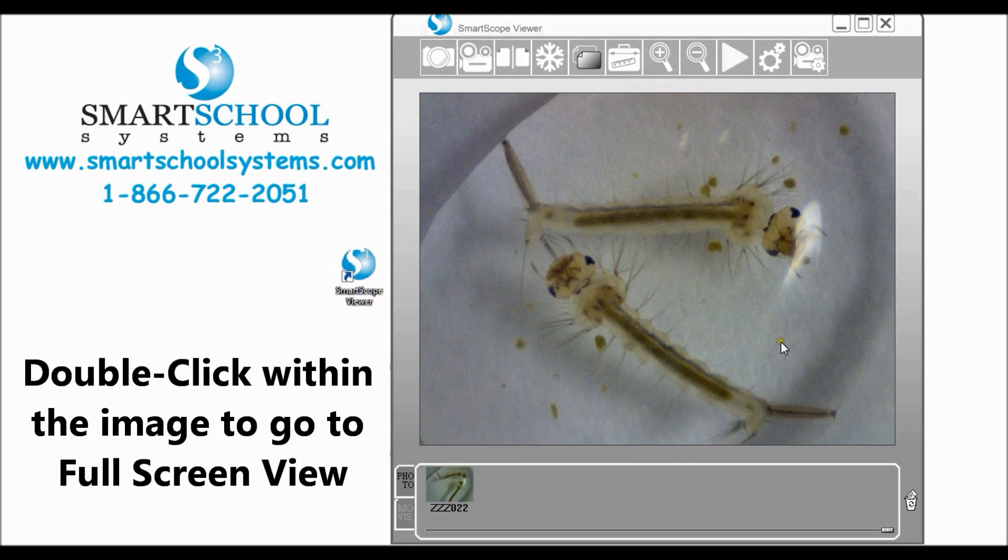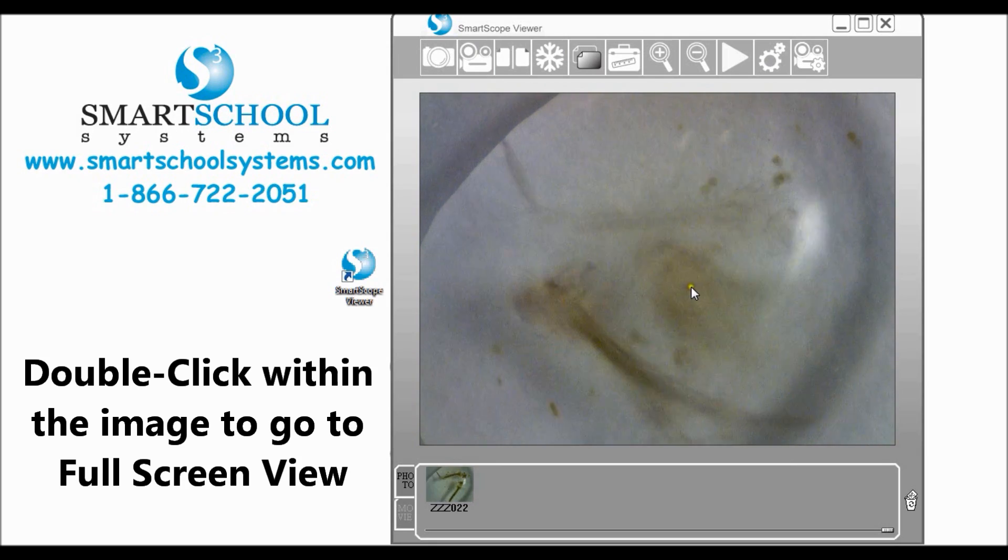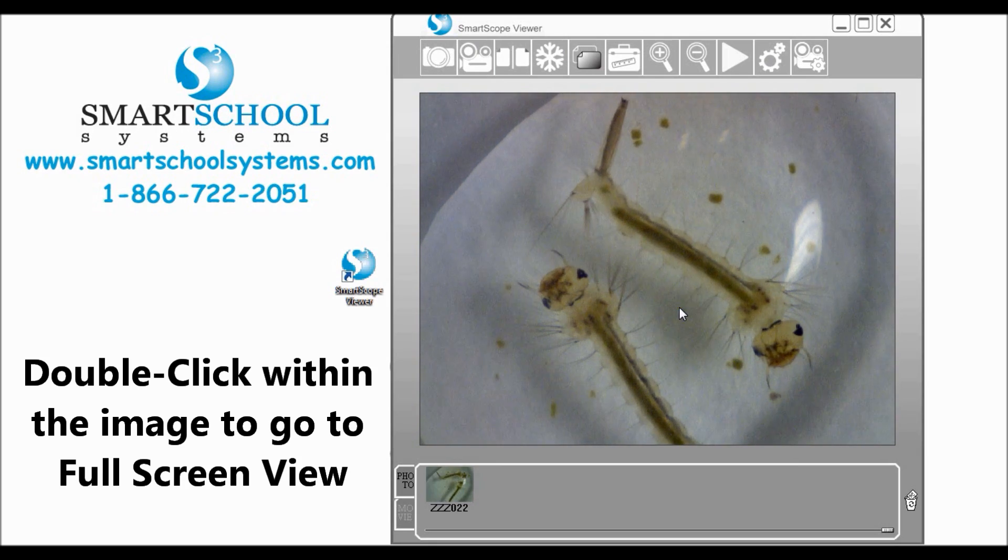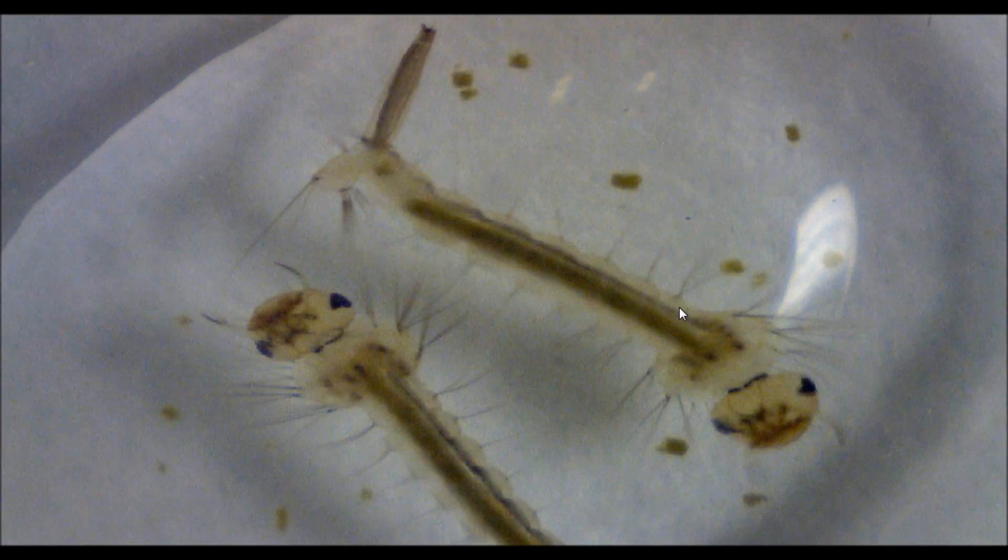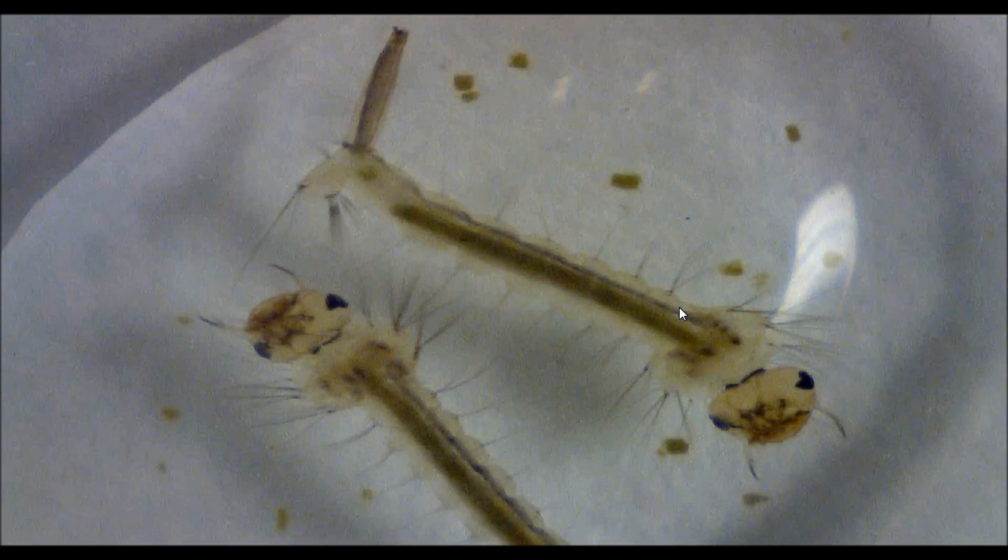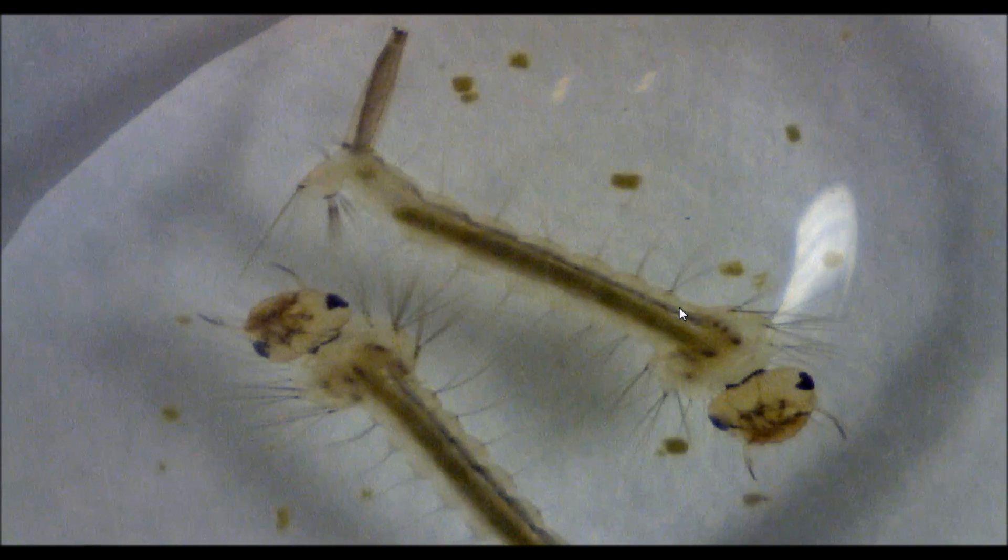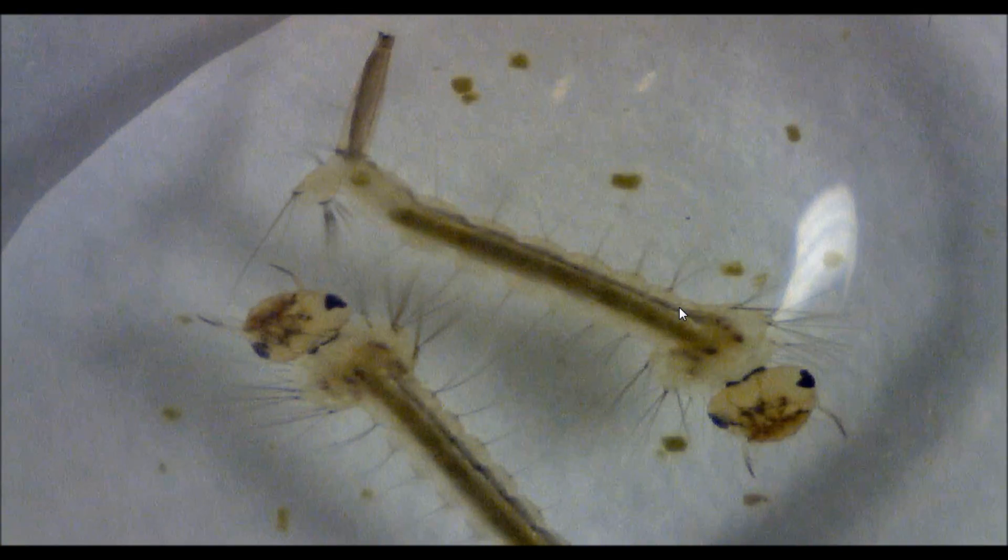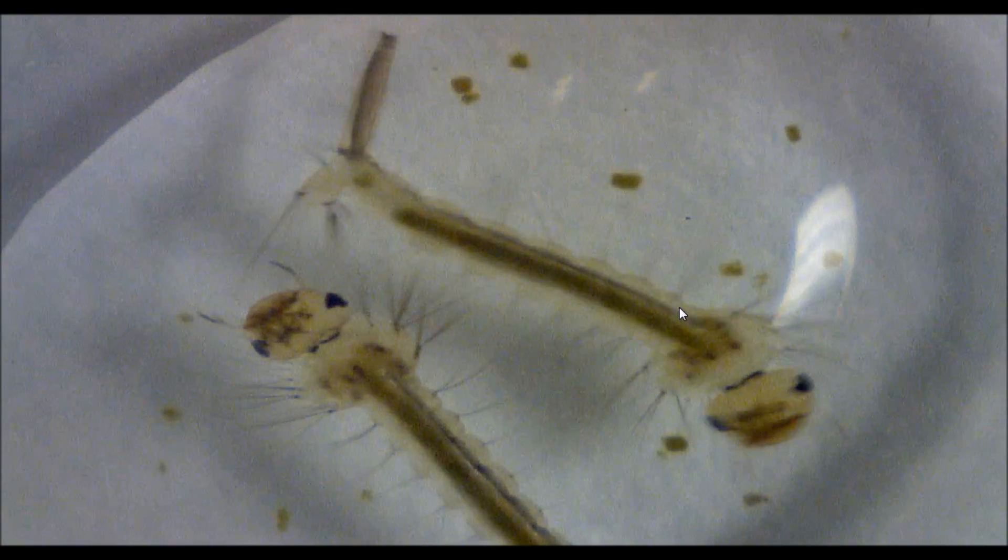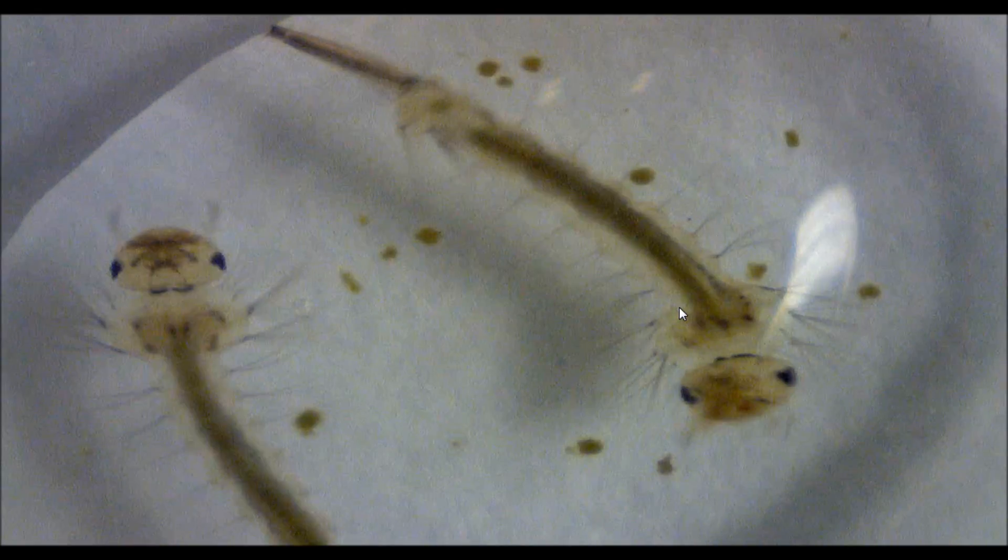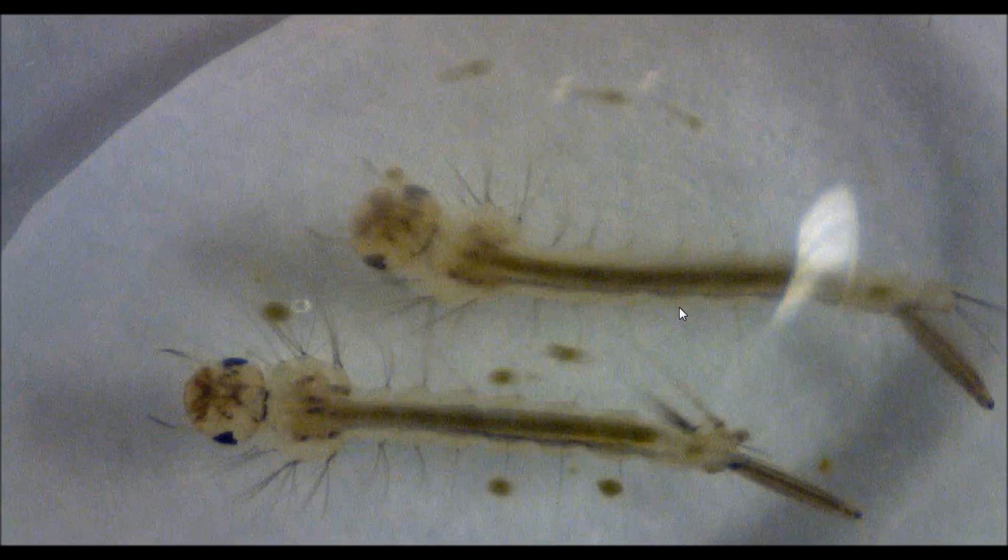What that will allow us to do is if you move your cursor to the middle of the viewing area and double click, it takes that to full screen view. This is great for having students see in great detail what is going on under the microscope. It's great for projecting on the wall for your students.